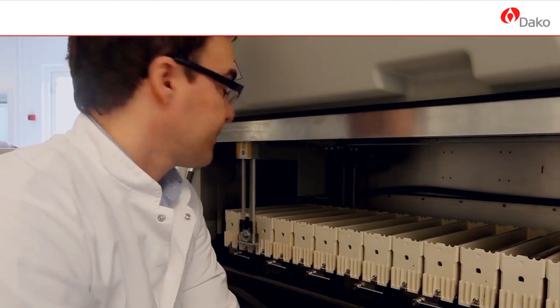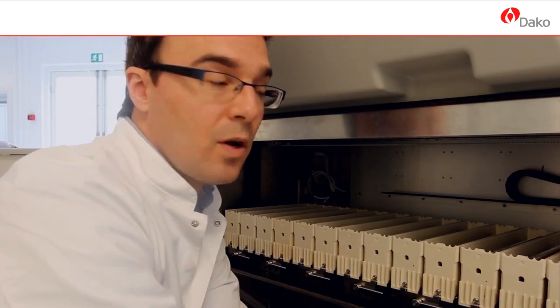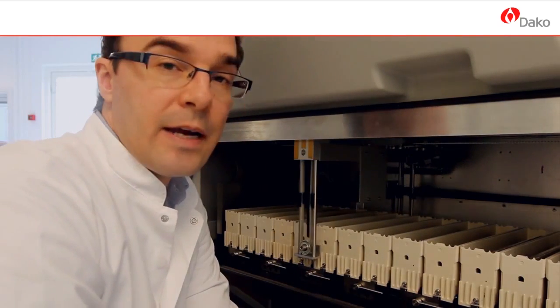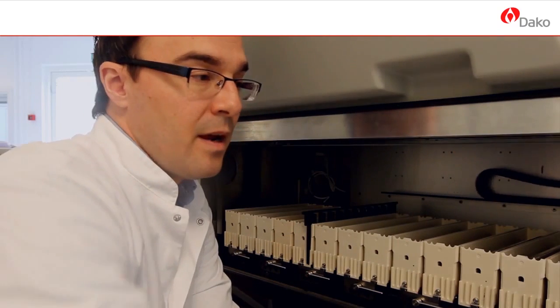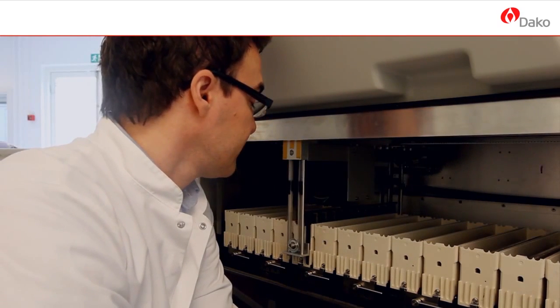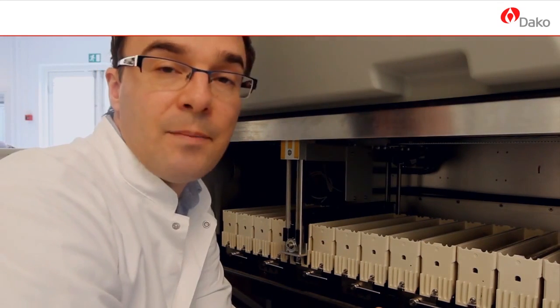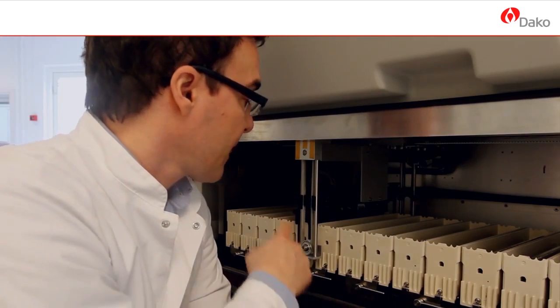When baking is done, the robot will pick up the slide rack and transfer it according to the protocol out in the dip tanks. It will place the slide rack in the dip tank. The incubation will start. The robot will pick up another rack if that's what's supposed to happen. They are placed in the dip tank for the time that the user has placed in the protocol.